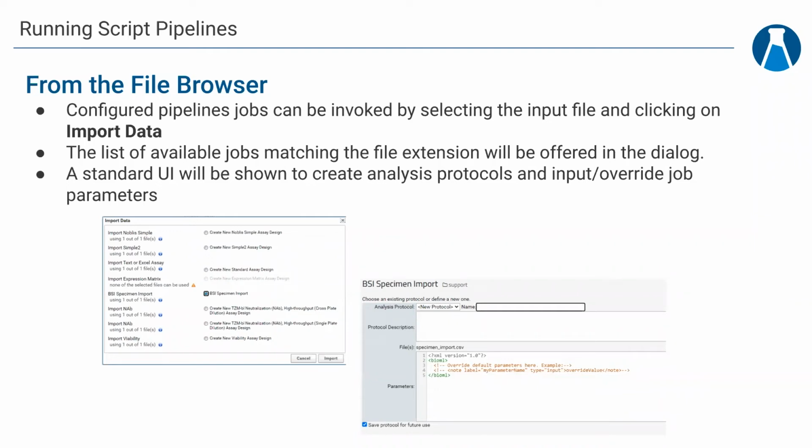Once you select the job you want to do, you can see a parameter dialog or a job dialog. This allows you to set any parameters that you need to set for your scripts or your tasks. These are added to each script and can be applied at execution.